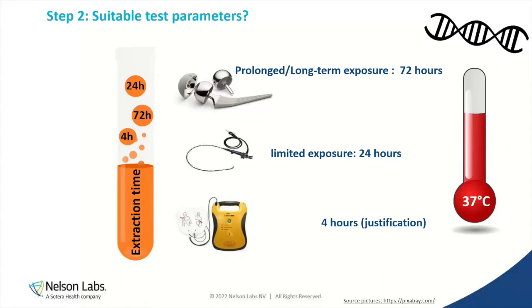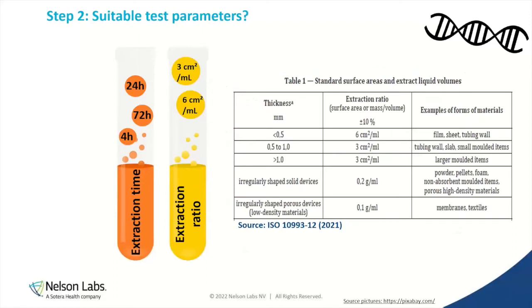The regulatory agencies want to see the failure. Yeah. They want to see it at the exaggerated conditions they expect, which is at a minimum 24 hours. And if it does fail, then you can say, oh, but my device is used here. Let's try a lower time. So to summarize, first fail, then you can go lower, but not directly. Yes, correct. Absolutely.